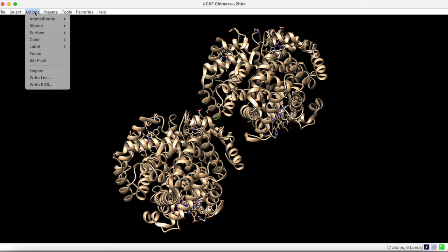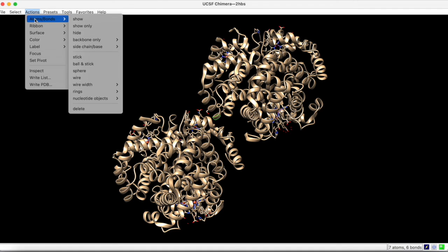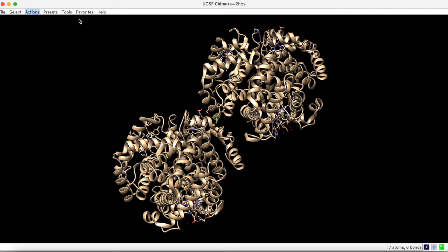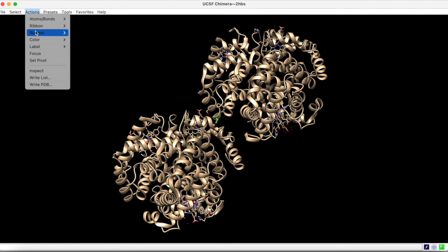Now under actions, atoms and bonds, we can show the side chain. And then we can focus in on the residue.